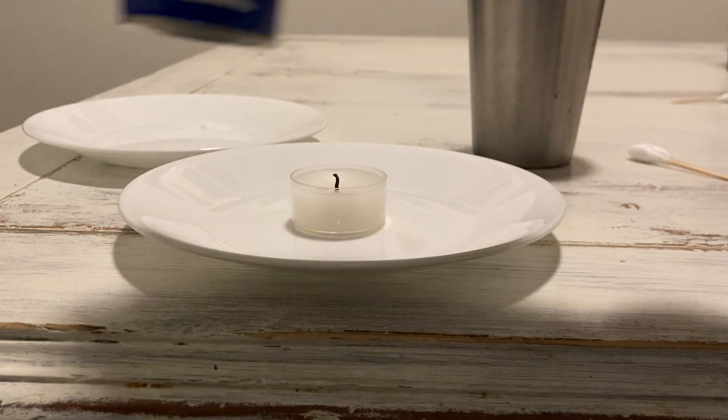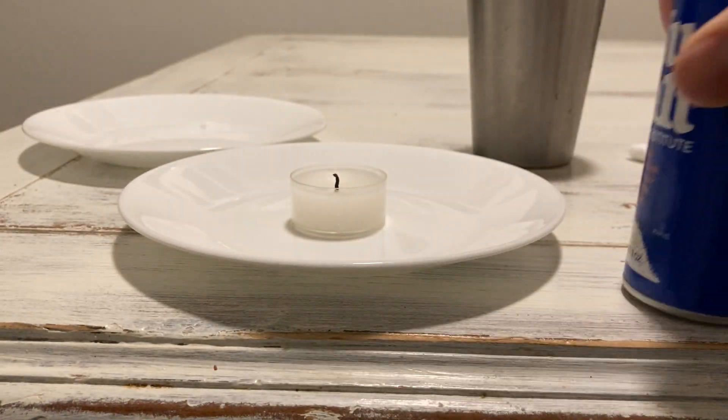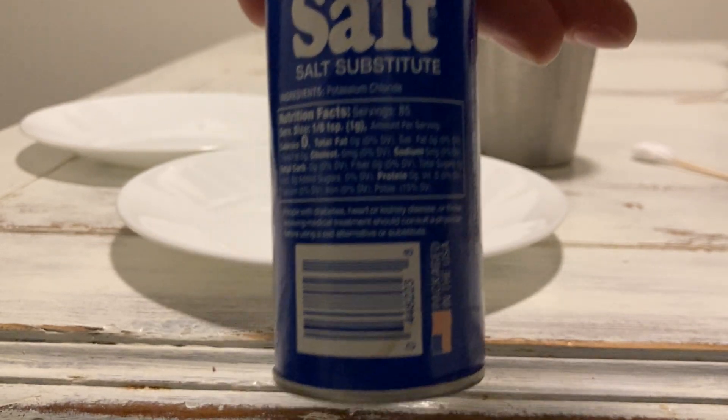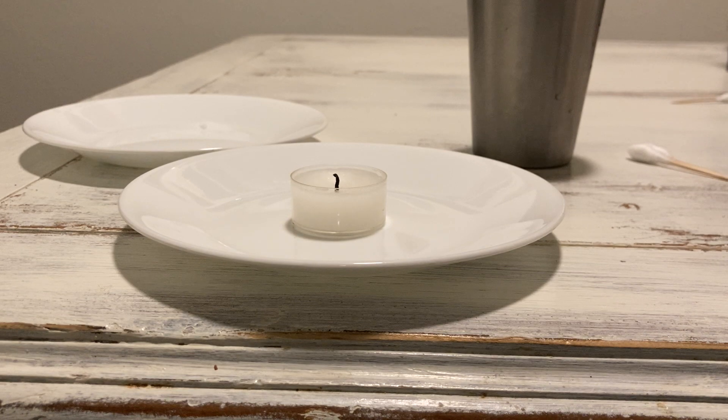This is salt substitute — you can get it at a regular store, it's just a salt alternative. If you look at the ingredients, it's potassium chloride. So we're comparing potassium versus sodium and looking at the difference in their reactions to flame.